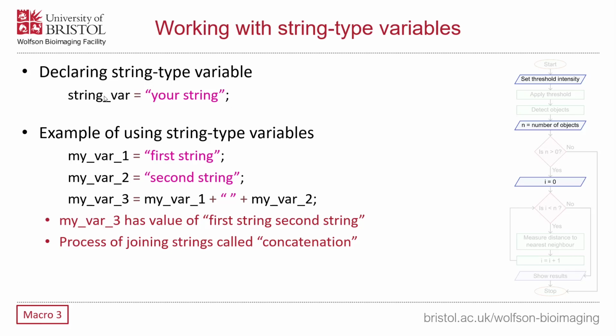As before, we can call this whatever we want within those parameters, so no numbers at the beginning, no white space, no funny characters. And here, the one difference, as I mentioned in the previous macro demonstration, is that we have these inverted comma quotation marks, and that indicates that anything between those is a block of text.